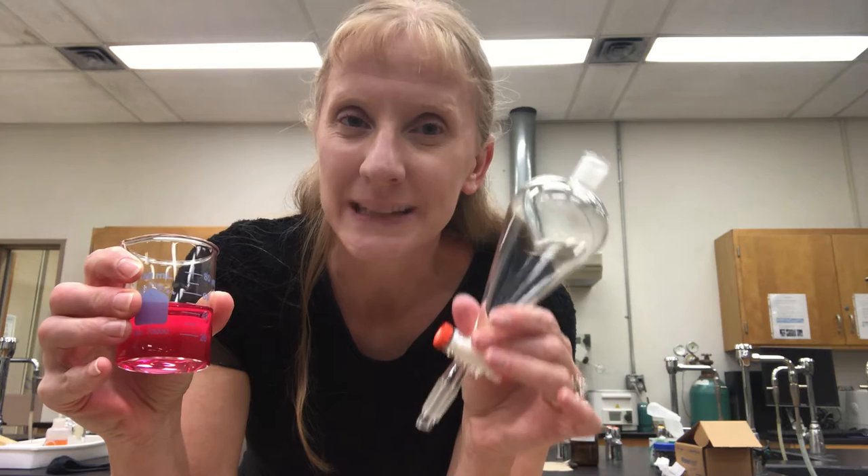Hello everyone, my name is Lisa Nichols and today I'm going to show you how to do a single extraction. I'm going to take this aqueous solution that has methyl red and some acid and I'm going to extract it into ethyl acetate using a separatory funnel.